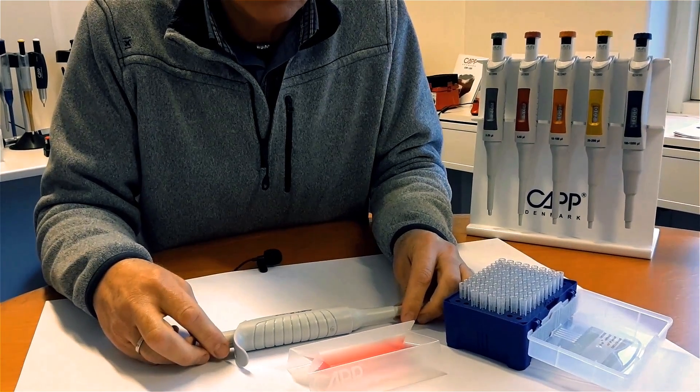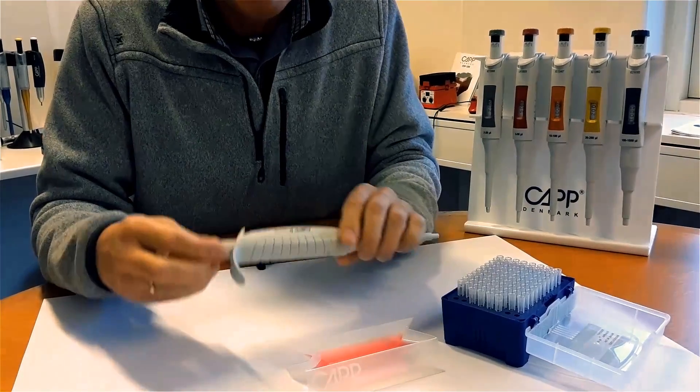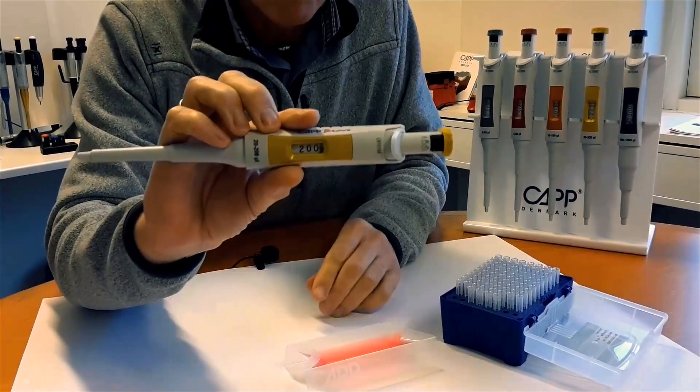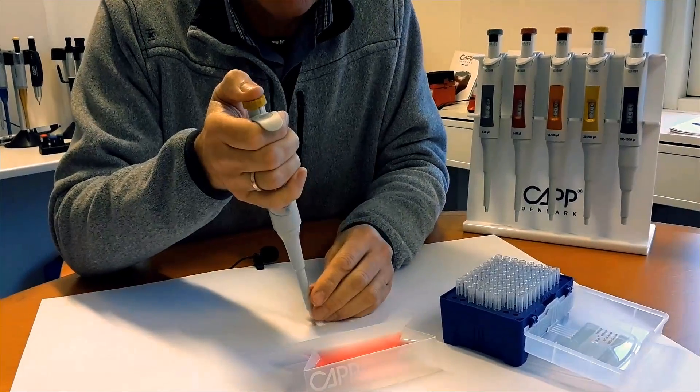Today we are going to do a functionality test on a CAT Bravo pipette. Adjust the pipette to maximum volume. Push the plunger and observe if the piston stroke is performed smoothly.